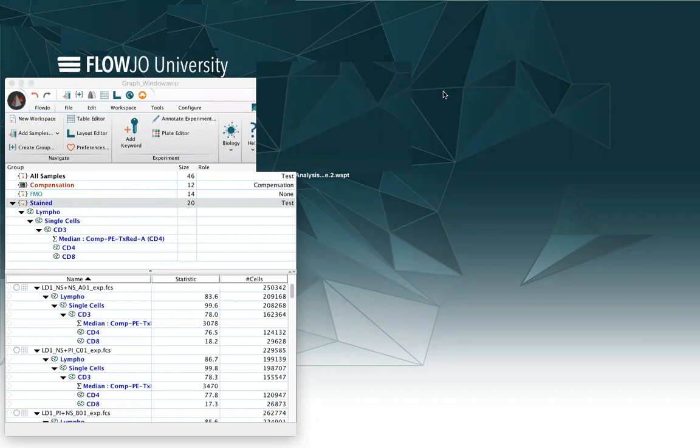A template is a snapshot of your analysis without the corresponding FCS files. Templates are really useful for repeated analysis, as the template file saves your group organization, including the compensation group, saves the gating tree and batched analysis, and the exports from the table editor and layout editor.